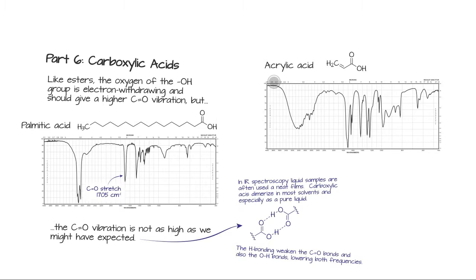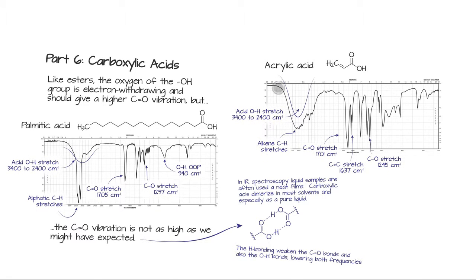Here's a more extreme case with a carboxylic acid. Over here we see a really large sort of OH-like absorption, but it is solidly underneath all of the CH stretches, which makes the CH stretching region kind of hard to interpret. But if you draw your line down at 3000, you see detail here above 3000, so you know you've got an alkene. Of course, we see the carbon-carbon double bond stretch there, so again, got an alkene. There's CO stretches in carboxylic acids. You see it there. You see it in this one.